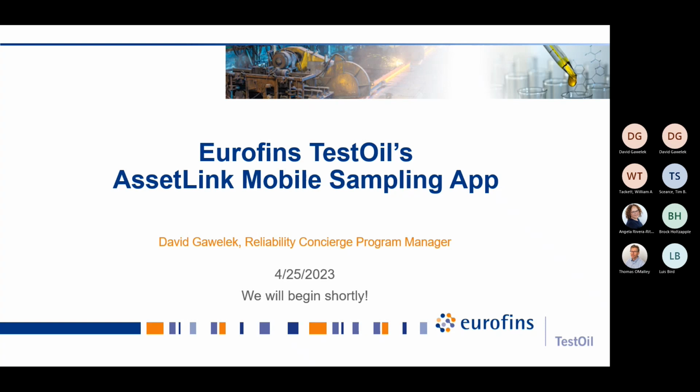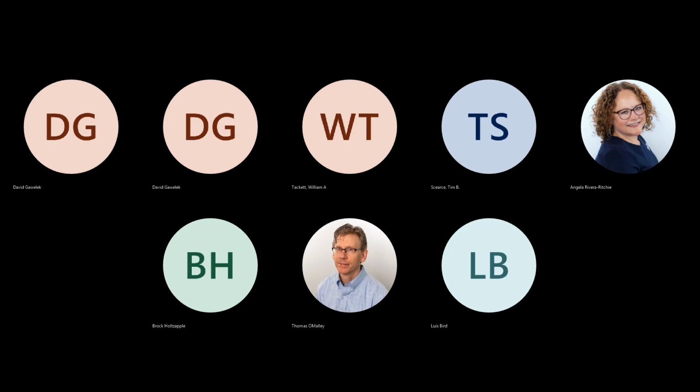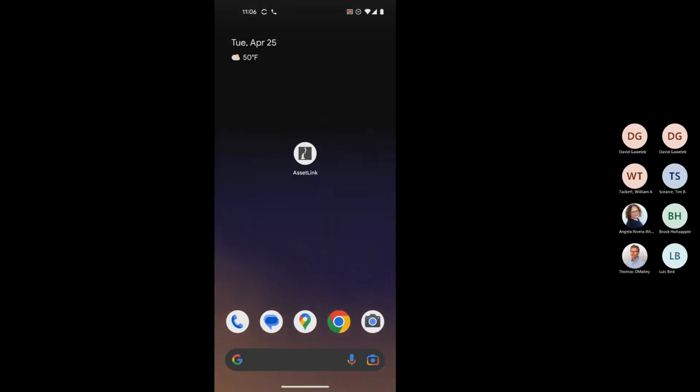With that said, give me 1 moment and I'm going to start up the app and I'm going to demo this live from my phone. All right, hello world.